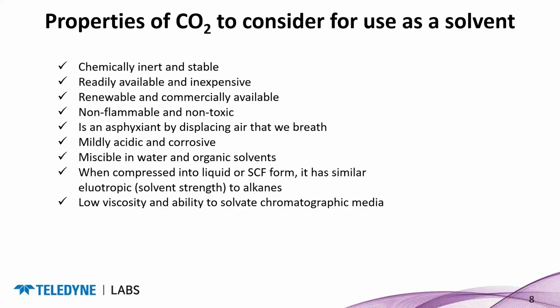So it's more normal phase-like, the way it's used. It also has very low viscosity, which gives it the ability to penetrate the pores of your chromatography media and give you much higher resolution on the same type of column you might be running in HPLC mode. And we'll talk more about that as well.